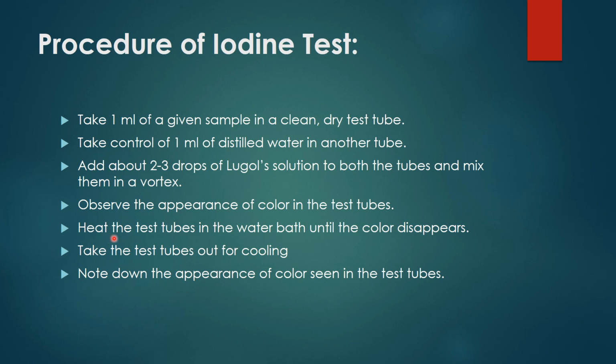Heat the test tubes in the water bath until the color disappears. The color will decrease on heating, as I told you.